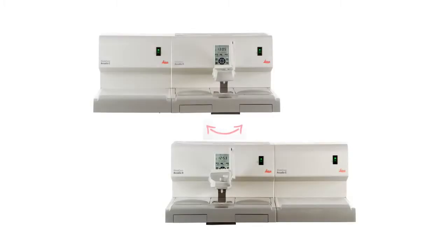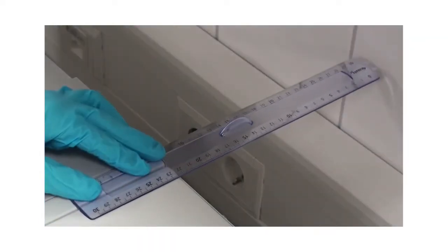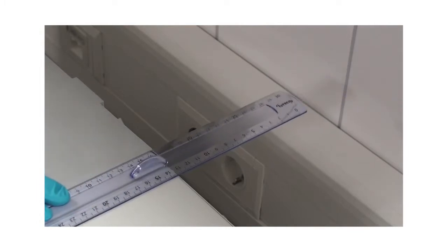Arrange the two independent HistoCore Arcadia modules according to the embedding workflow that best suits your laboratory workflow. The minimum distance between wall and instrument should be 15 cm.